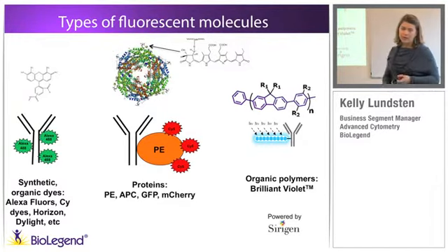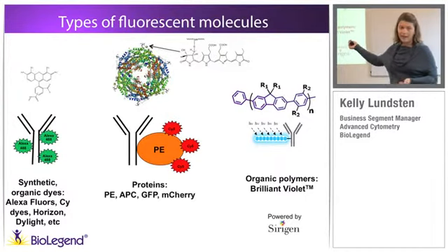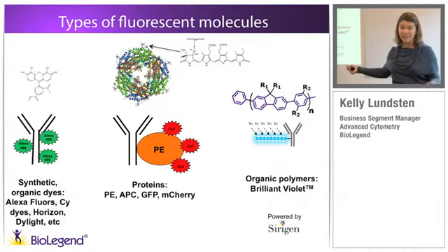However, it's entirely made in organic solvents, and by that I mean acetone. And because of that, it's not going to be affected by its environment nearly as much as a protein would be. So I like to say that it's as if these two, organic and proteins, got together and had a baby, and they made a molecule that is relatively fantastic for having the strengths of both of its parents.